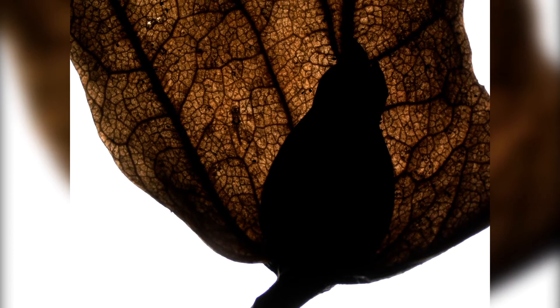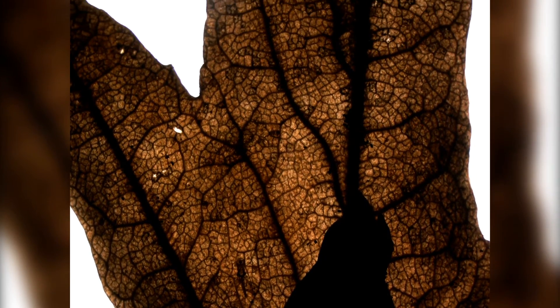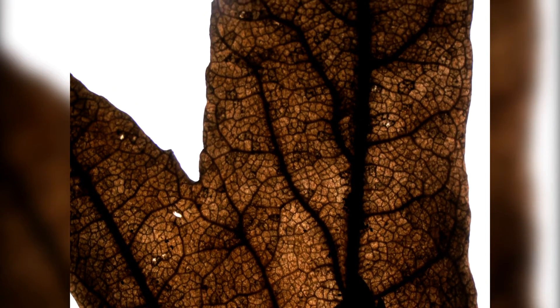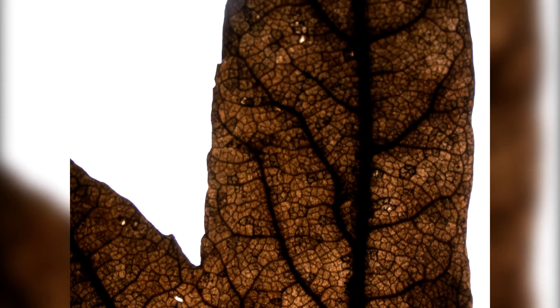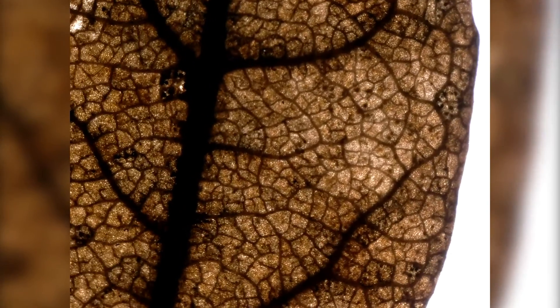Let's try some transmitted light. Wow, now you really see the veins running through the leaf, distributing all the nutrition — when it was green — to the other parts.